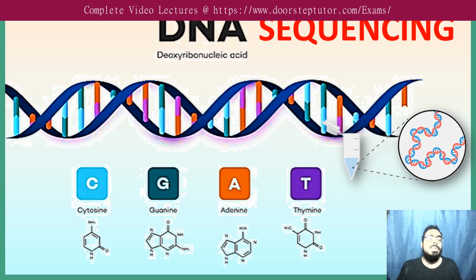Now, the main purpose of a genomic library is not only to conserve the DNA, but at the same time also to sequence the DNA, especially genomic libraries. But many different strategies have to be made to sequence that large amount of genome at once. So before sequencing that huge amount of DNA, let's see how DNA was sequenced in previous times.